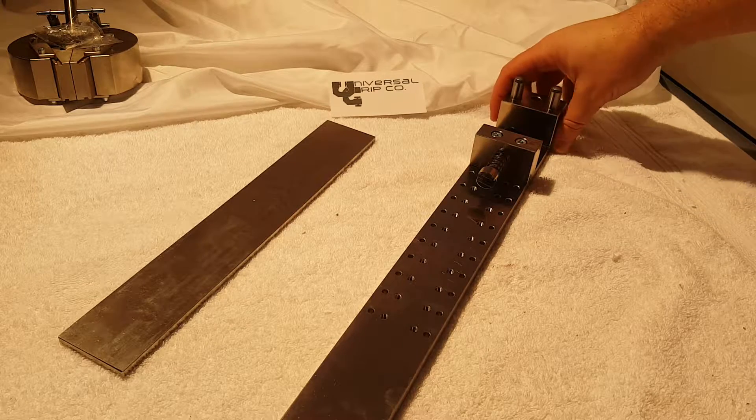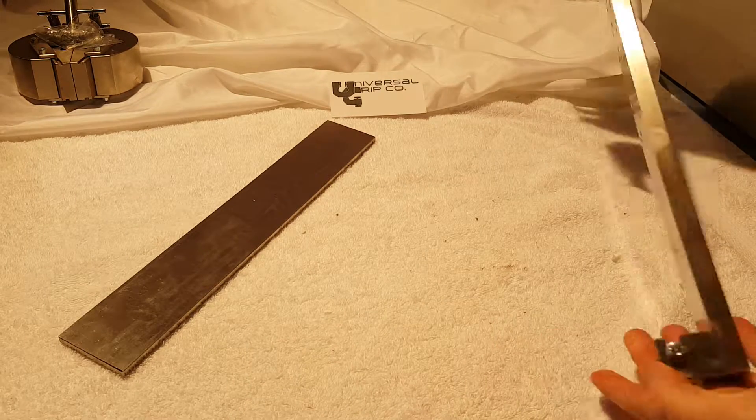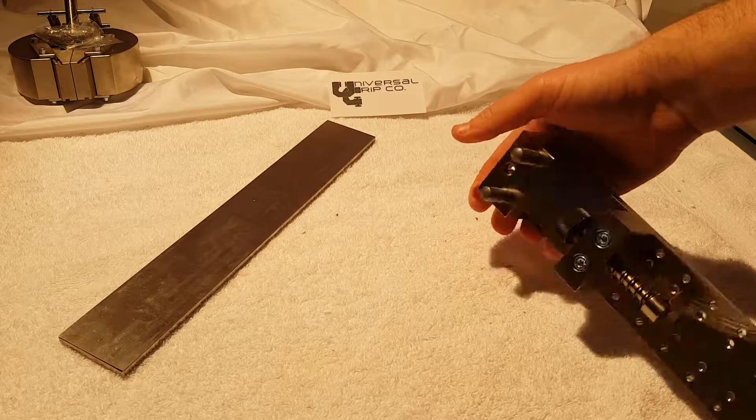Hello everyone. Today we are demonstrating our 180 degree peel fixture.